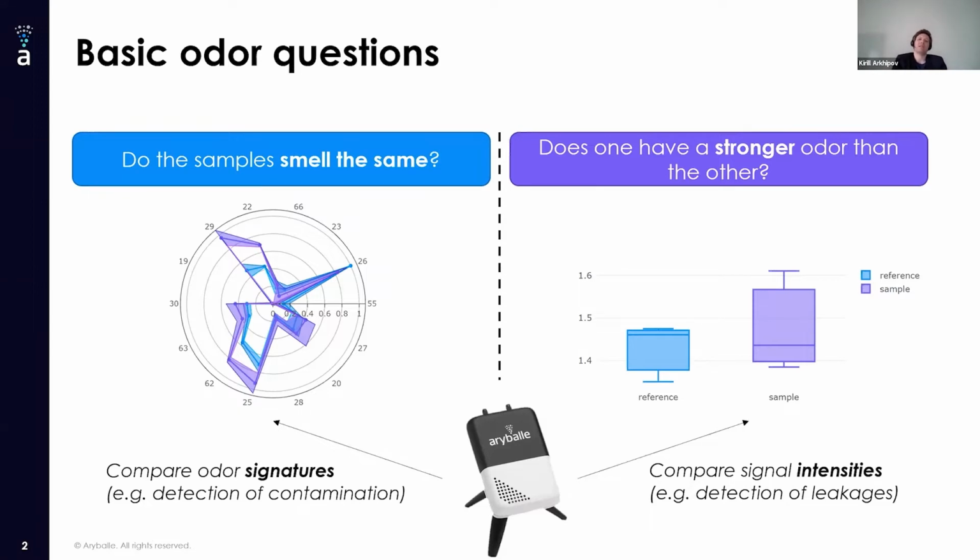And do one of those have a stronger odor than the other? So these two questions were asked, and we designed a tool that would enable the users to answer either one of those or both of these questions at once.